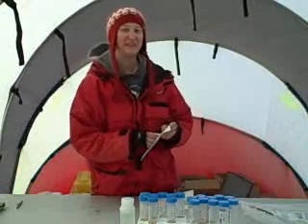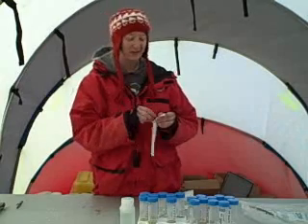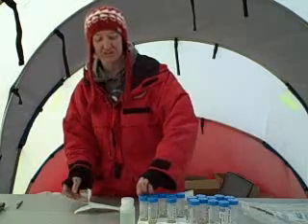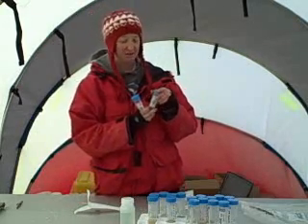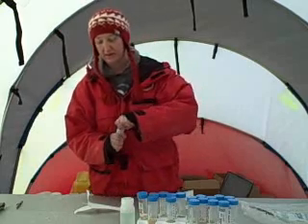One of the dirtiest places in our bodies is our hands, and I haven't taken a shower in a week, so I can imagine that my hands are going to be pretty dirty. So we're going to see if I brought any bacteria to Antarctica with me. Our next one is we're going to test the bacteria that are on my hands.